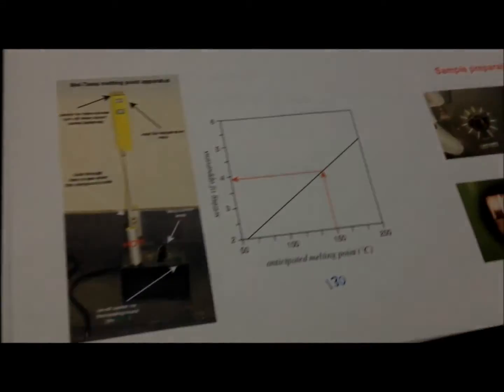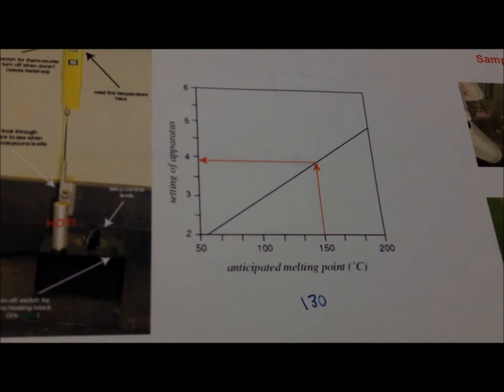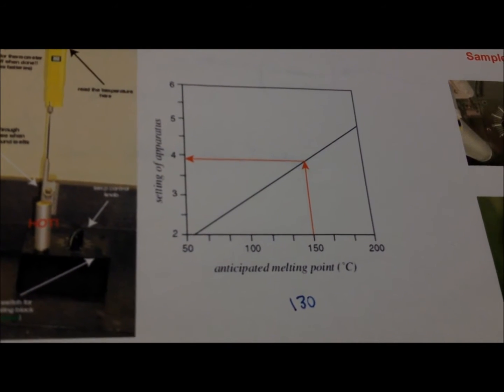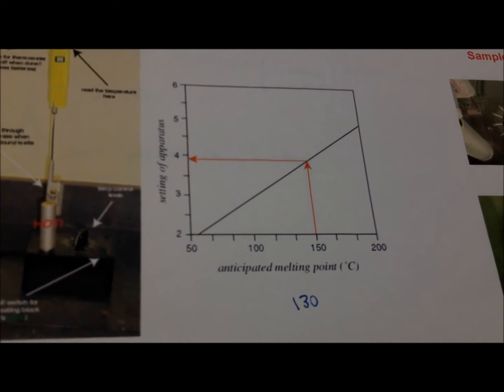Once you've inserted your sample, you should refer to this graph. Based off the literature value of your sample's melting point, you will set the apparatus to the appropriate setting.